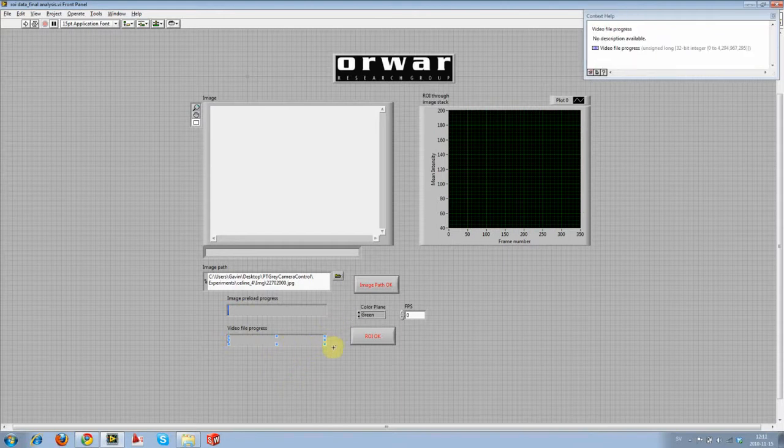We're also handling the files a little bit more correctly by, rather than simply changing it to a grayscale image, which for these data sets is perfectly fine, for certain data sets you actually want to extract the color plane instead.